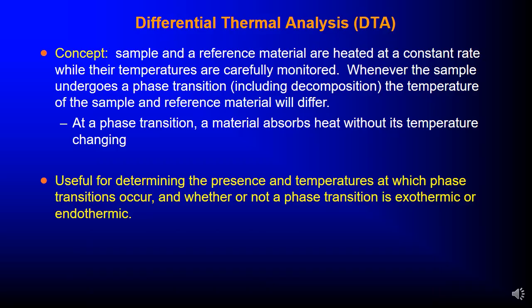So, differential thermal analysis. The concept is that the sample and the reference material are heated at a constant rate while their temperatures are carefully monitored. Whenever the sample undergoes a phase transition, including decomposition, the temperature of the sample and reference material will differ. At a phase transition, a material absorbs heat without its temperature changing.